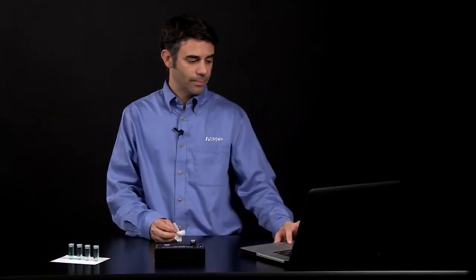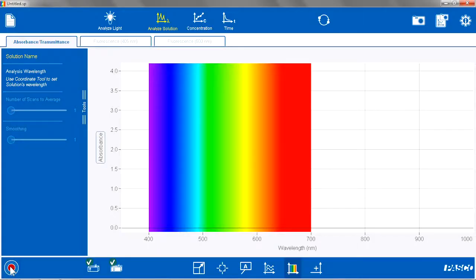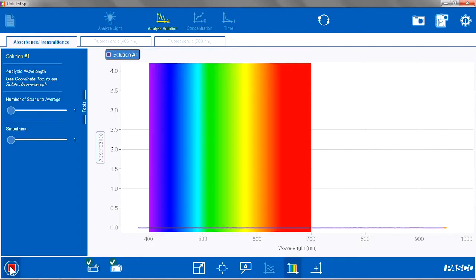After the calibration is complete, I am going to hit Start just to make sure everything worked correctly. I see that I have an absorbance of zero, which is what I want for my calibrated blank.